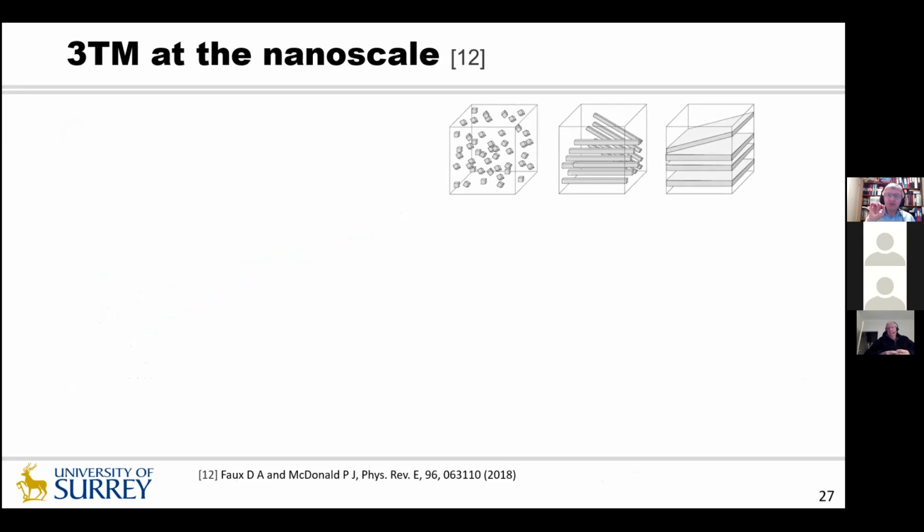And we looked at 3 types of nanoscale porous systems where the confinement is in sort of 0-dimensional, like quantum dot systems, in which the nanoscale dimension is in all 3 directions. 1D systems in which the nanoscale sizes are in 2 directions, and our planar pores, which are 2-dimensional with the nanoscale restriction in just 1 direction.